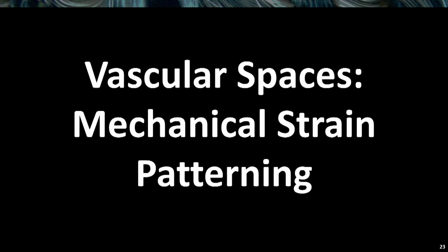So I'm going to talk a little bit about two projects that I've used Dragonfly for in various capacities for visualization and some processing. This is from my dissertation work, and this is something that I found Dragonfly towards the end of when I was stuck on a problem. So it is femoral neck segmentation, but it is through morphological smoothing and binary operations. So my goal is to move towards the deep learning and machine learning, but you'll see it's a bit more brute force than what we've heard so far.